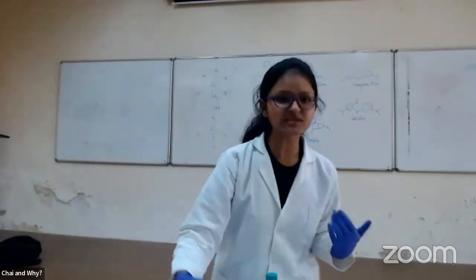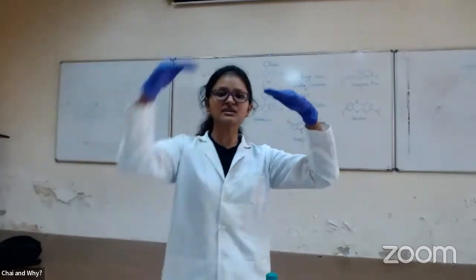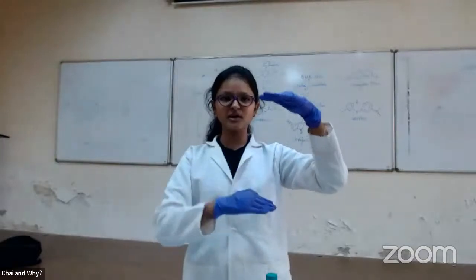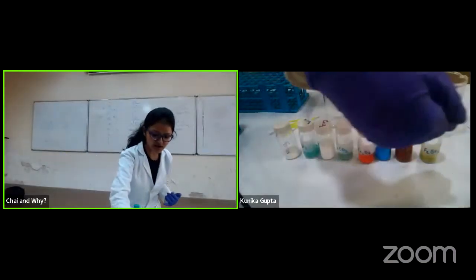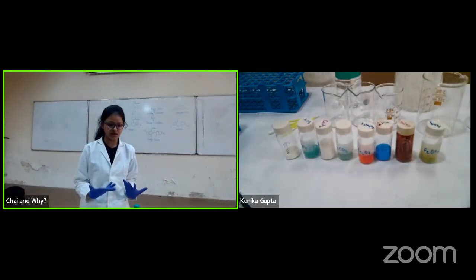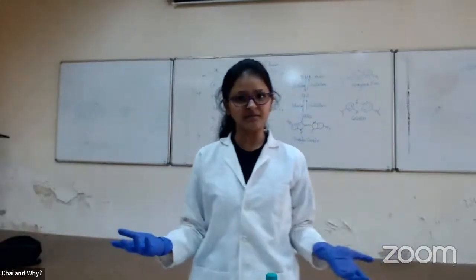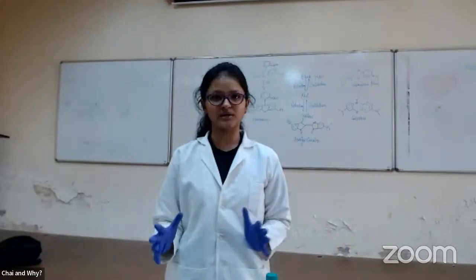And so it is with these colors. Their relatives live on the different floors, and so they are transitioning from different states. And corresponding to these levels, like third to seventh, third to fifth, there are different colors. And hence we see a range of colors in my lab. Now, what do these colors depend on? Like, if I have, let's say, copper sulfate, will it remain blue every time? Or if I have this potassium dichromate, will it be orange always?